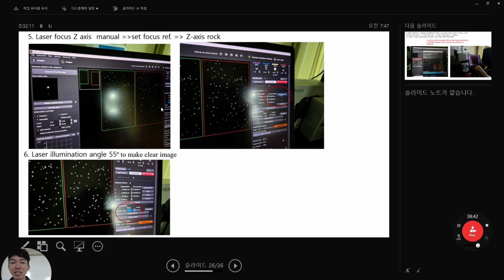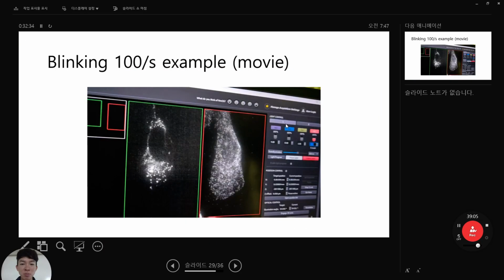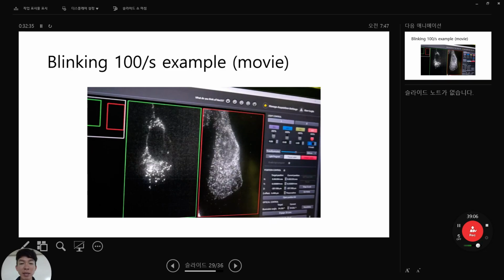So even though you get this right side, which is maybe our major focus, sometimes while you are exciting, green color is obtained. People are asking, is this a real image? This is a real image. But at the moment we are only using this red.